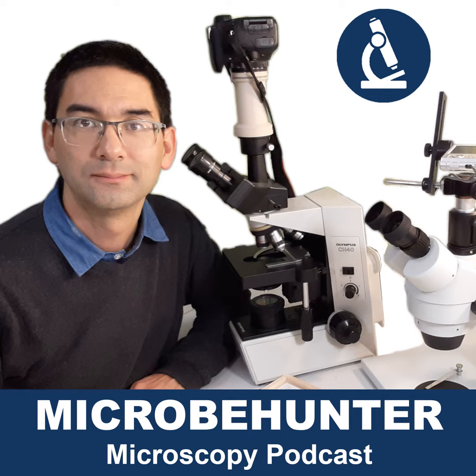So let's talk about different microscope standards today. The most common standard is the so-called 160mm DIN standard. However, there are also other standards, for example the less common 170mm standard. And there are so-called infinity optics, which are not standardized across manufacturers; different manufacturers simply define their own standards, so these are proprietary.